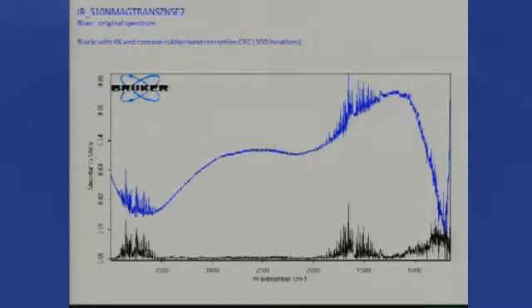But in this particular case, rubber band correction gives a very good baseline correction for spectra where all the bands go in one direction. And if you look at this, it's all positive. All the baseline is a positive baseline. But the baseline is in fact a little bit above that, because the most negative parts of the spectrum are due to noise.